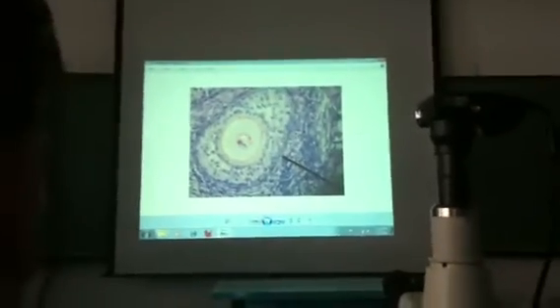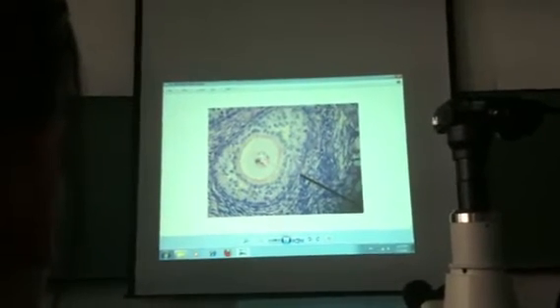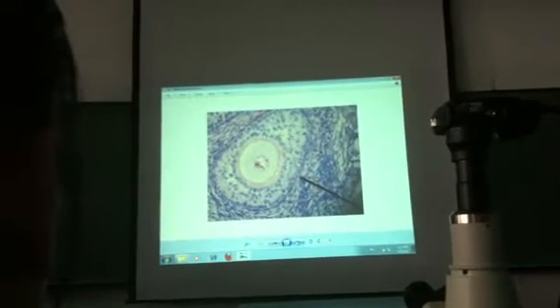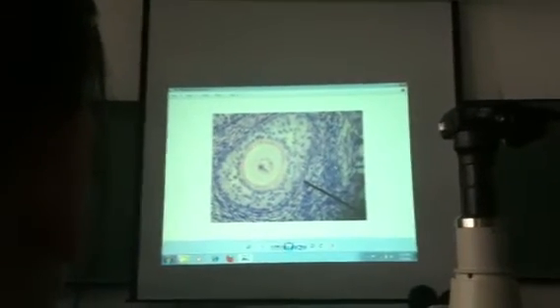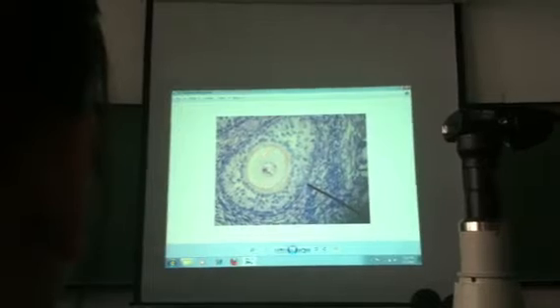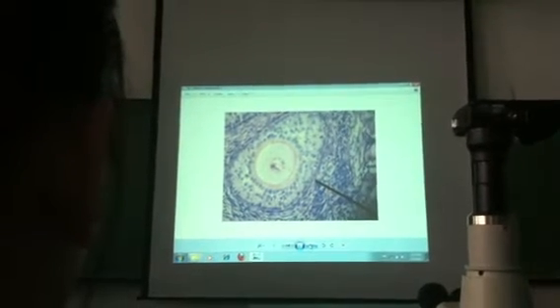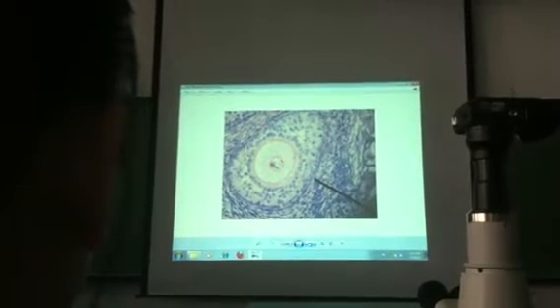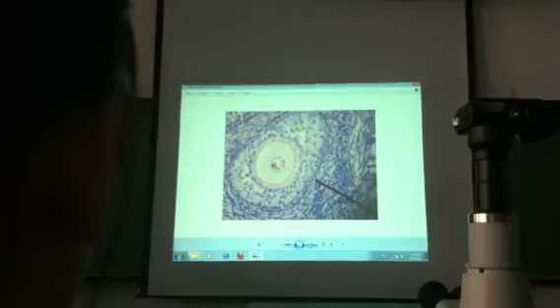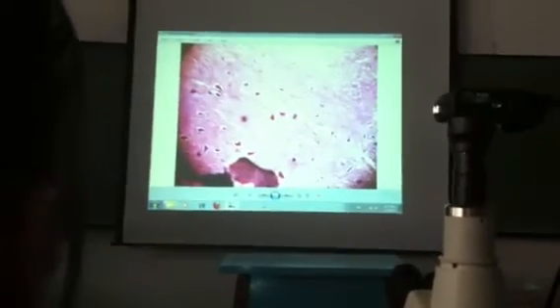Okay, but the side question can ask you what does the nucleus consist of. Okay, so you can see there the cell membrane. No other organelles. You don't see mitochondria, don't see Golgi apparatus, etc. The most prominent here would be the nucleus, in some other specimens, the nucleus and the nucleoli. Next slide. So this is a typical cell. That is a typical cell. The ovum.